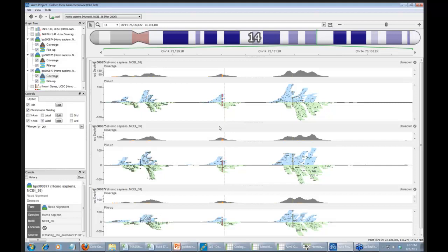I'm not exactly sure what the answer to that is, because I didn't generate the data, but all 3 cores are using GATK and following the best practices published by the Broad Institute. After variants are called, I know they're using GATK to generate the multiple sample VCF format following best practices.